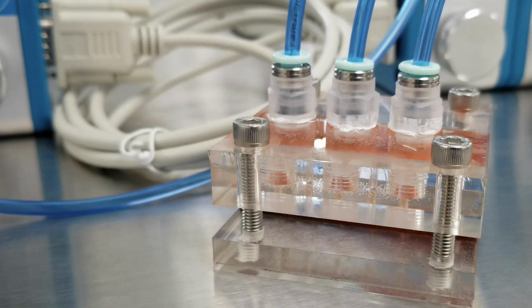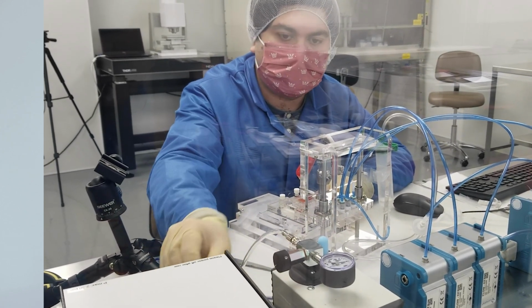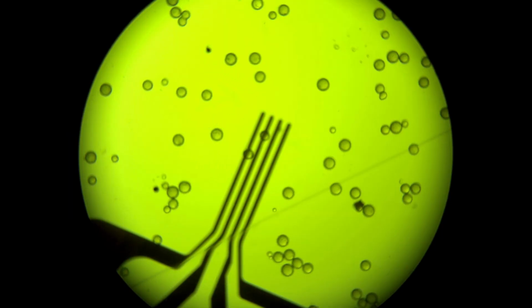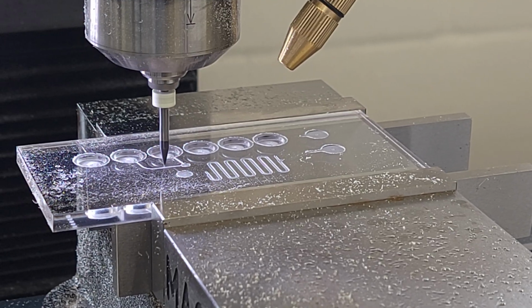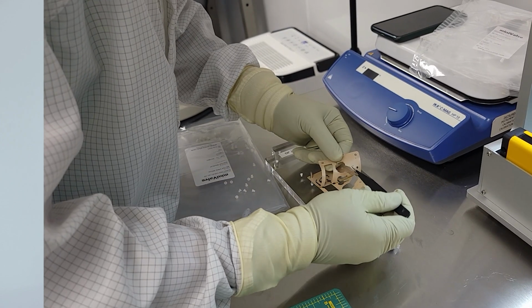Hi, my name is Lorenzo Gutierrez. I'm the Microfluidic Manager and a Bioprocess Engineer at Starfish Medical. I have been with product development for over 30 years, and for the last 10 years, I've been working on point-of-care devices for a variety of disease panels. In my line of work, we usually do immunoassay, molecular, or cell-based assay. We work on projects that require cell culture, characterization, sorting and detection, and reagent formulation, including biomaterial products, to support our clients. We develop and build associated instruments and fixtures, as well as prototyping and production processes.